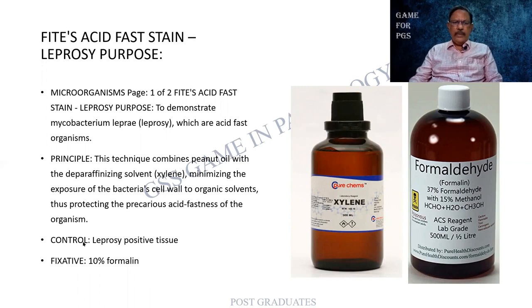The control always must be used. It is a leprosy positive slide. The fixative is 10% formalin. What is 10% formalin is a different story. We shall see that under fixatives.